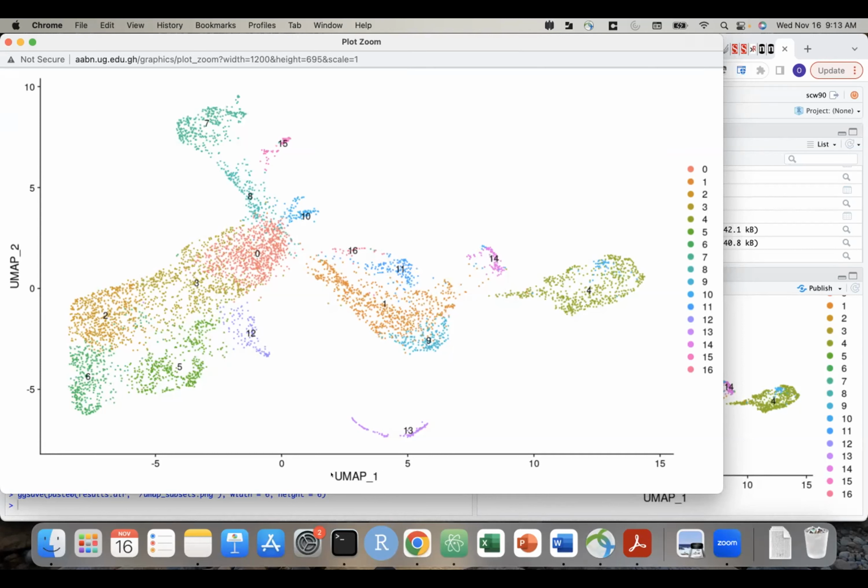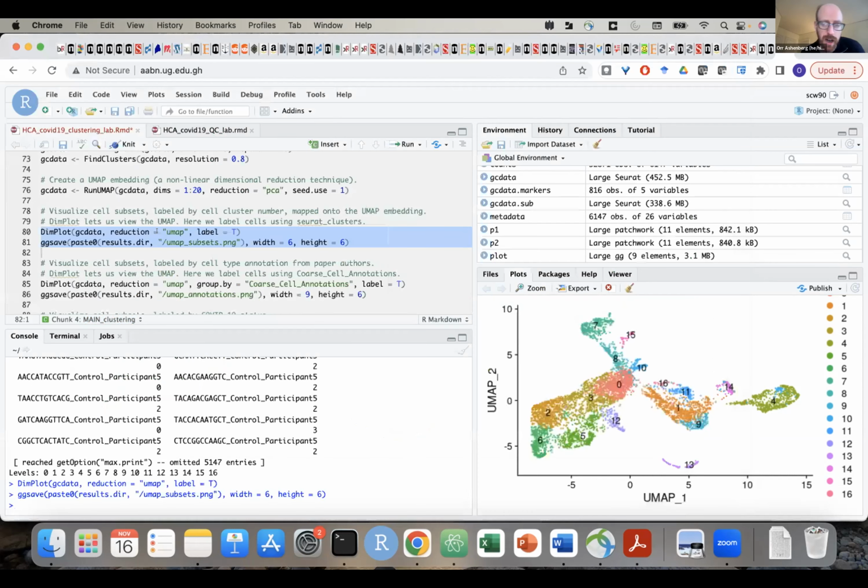No, I just have another quick question. Sure. When I run it, I did get my UMAP, but the code had an error in grid new page. Is this normal? Where did you have an error, Isabella? Which line?